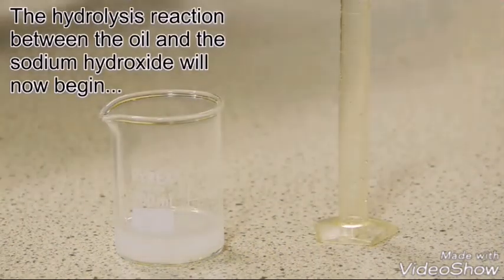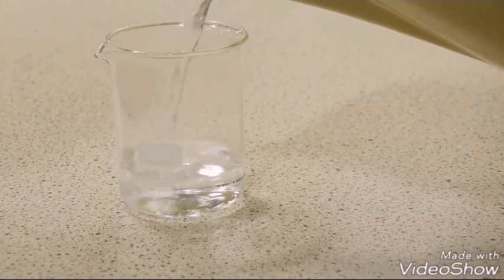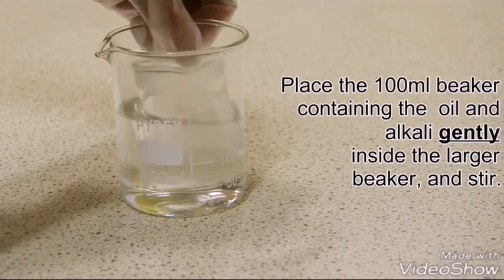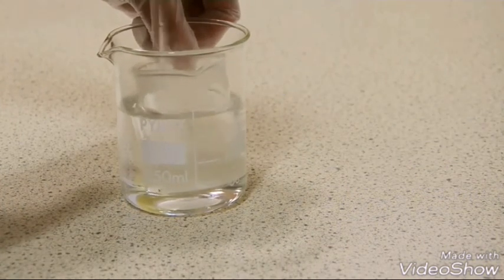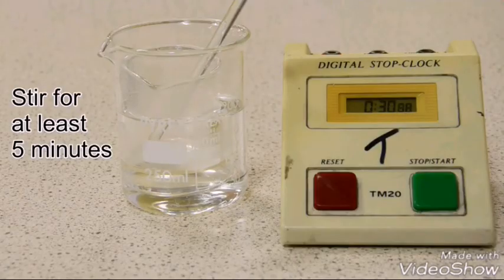We're now going to speed up the reaction by standing the beaker containing the ethanol, sodium hydroxide and castor oil in water, hot water, and stirring. While we're stirring the mixture of oil and alkali, the fat molecules in the castor oil are being hydrolyzed, which means broken down, to make free fatty acids.